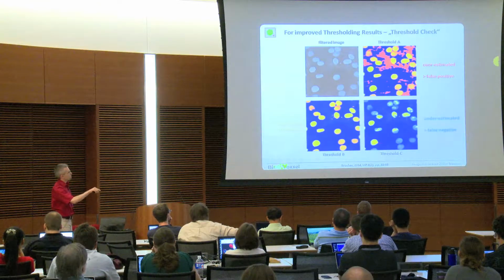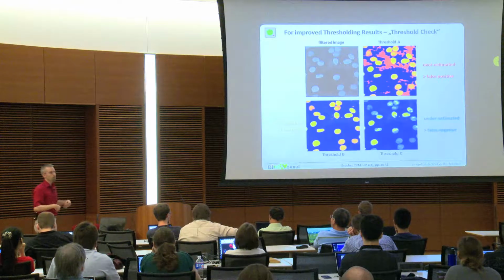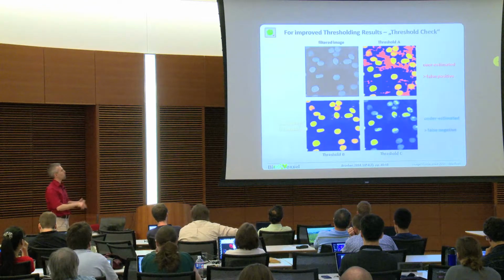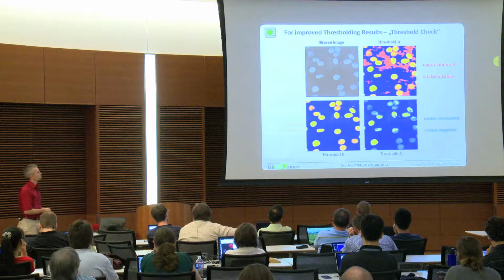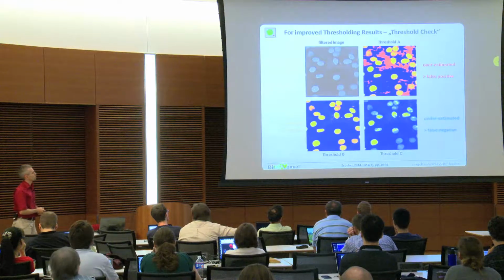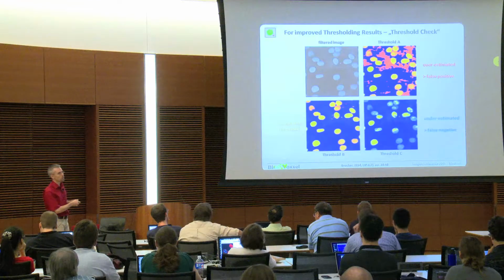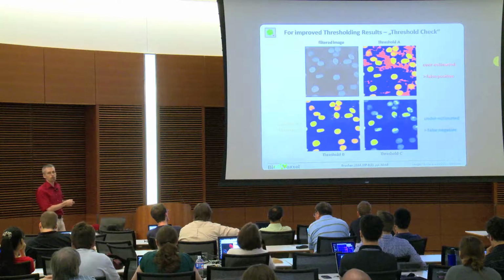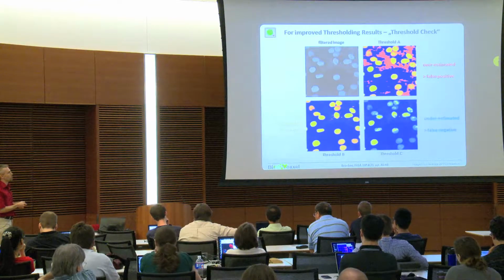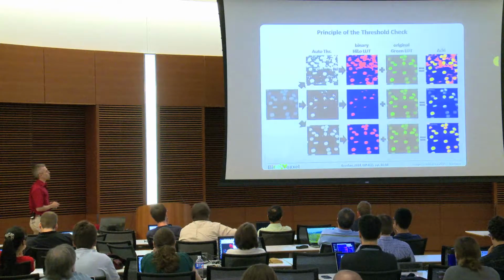And in that case, when you have something like that, that means you have too much false negative ones which are not found by the threshold, but you want to have them. That means bright blue, false negative, red, false positive. So what we would look for is a threshold which looks like that, and that is actually fairly well. We have still two problems for our later processing. We have connections, we can deal with that. And we have small particles, we can also deal with those ones, at least if the size between what we want to have and what we don't want to have is somewhat different.